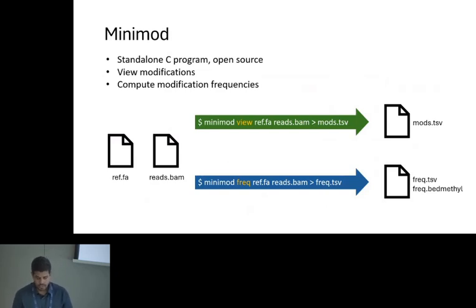While testing RealFreq, we noticed our modification computation performing very well, and we decided to bundle it into a standalone C program we call Minimod, and currently it can be used to view modifications and also compute modification frequencies.